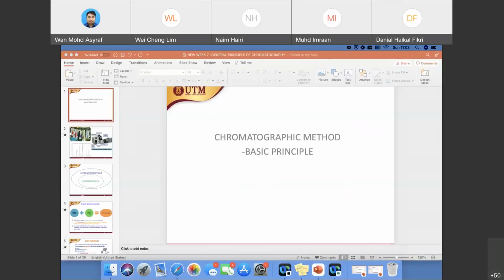All right. So basically, now we are going to look into a new type of instrumental analysis. Before this, you have learned about spectroscopic instruments, which is atomic absorption, and then you have looked into atomic emission. You have looked into the ICP, ICP-MS, okay?